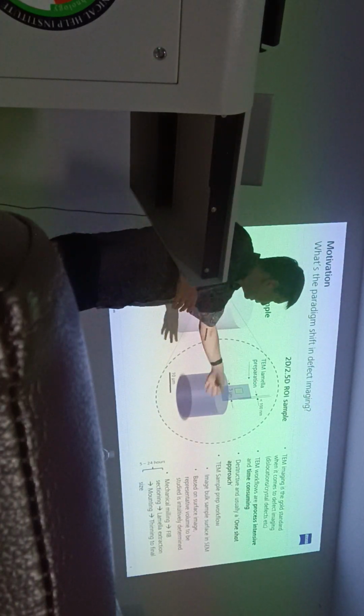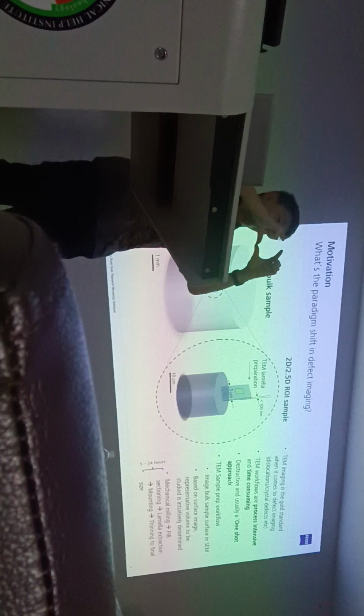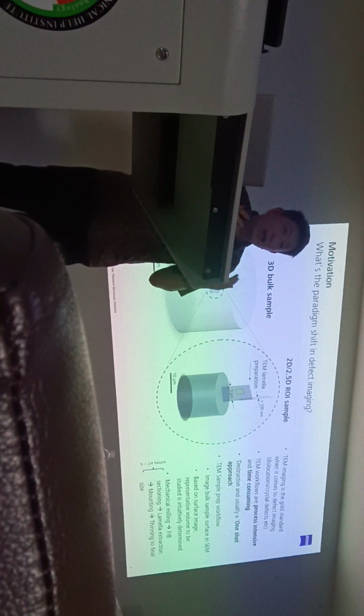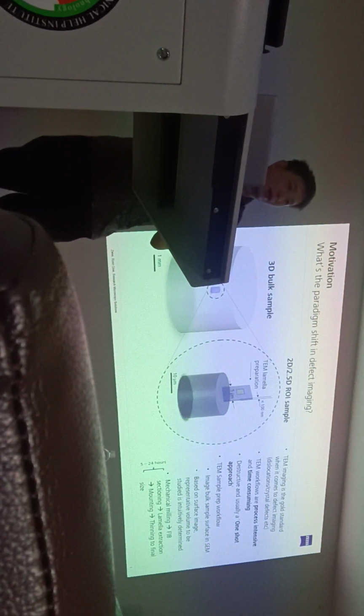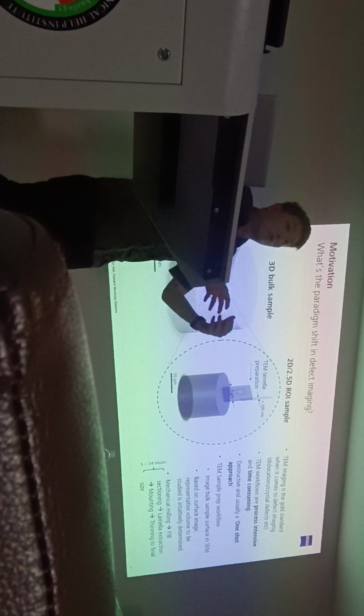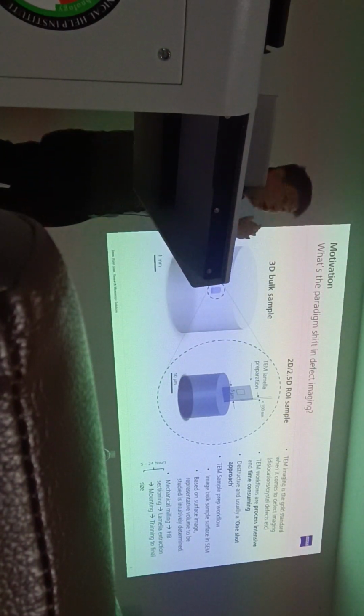But one of these took about 2 hours, right? And you have these big materials, but you only cut a very thin, very small layer. Is your sample representative? Might not be, right? And you cut the second one, you waste another 2 hours, you look again, oh, it looks different. Oh dear, I need to take the third one, and the fourth one, and the fifth one, right? So it took a lot of time.